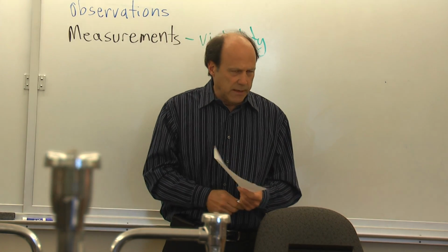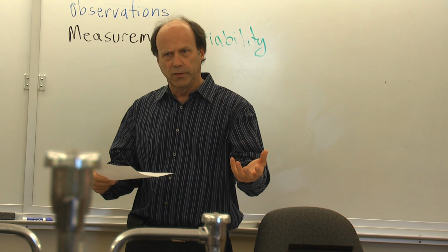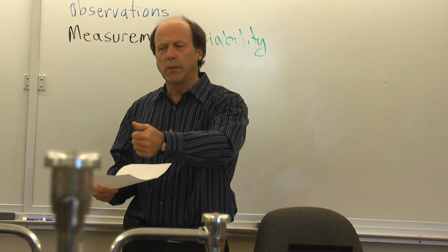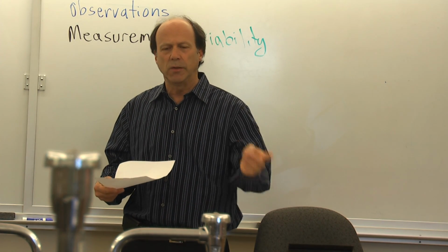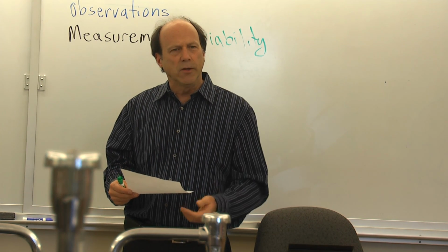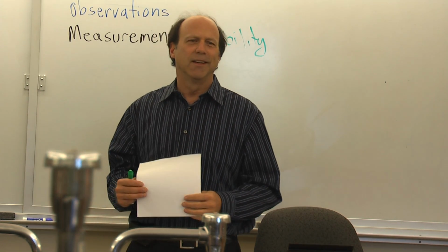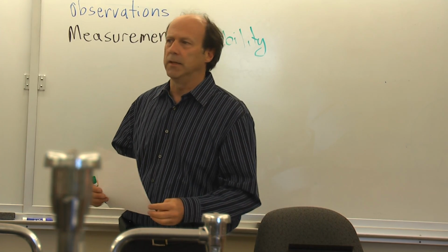But even the counting that we're doing, electronic counting: we trypsinize the cells in the dish, and we make a slurry out of that, and we take our cell suspension and we count that in the cell counter. You guys have done a lot of that week after week. We've been counting cells and doing the growth curves. But do you really know that the cells are viable? Think about that. The electronic counter, how does it count again? It was one of the questions on the quest. How does the electronic counter that we're using detect a cell?